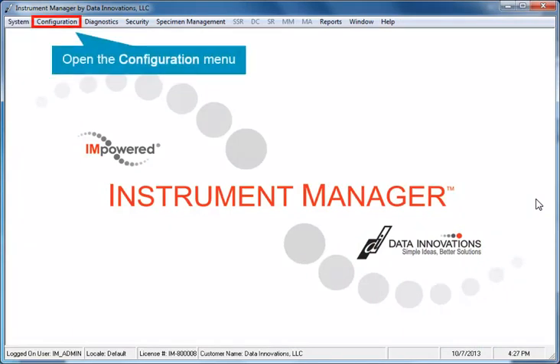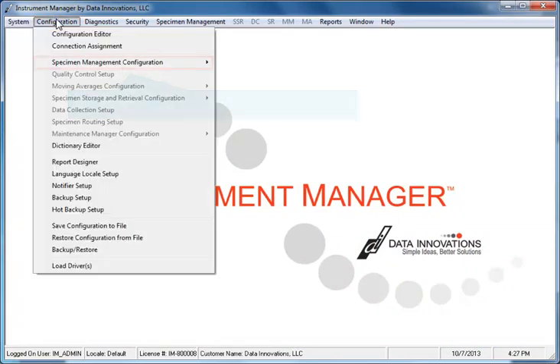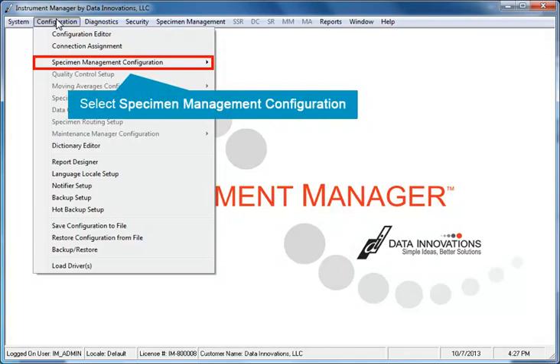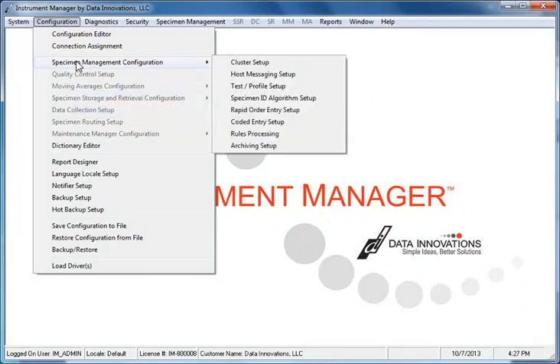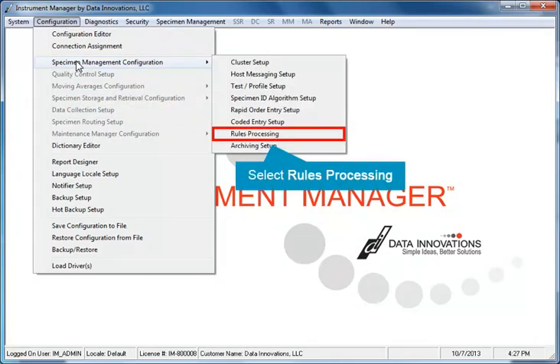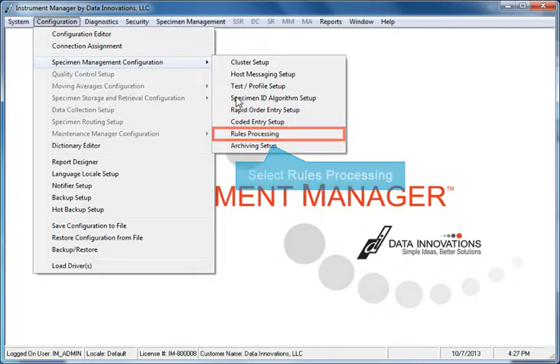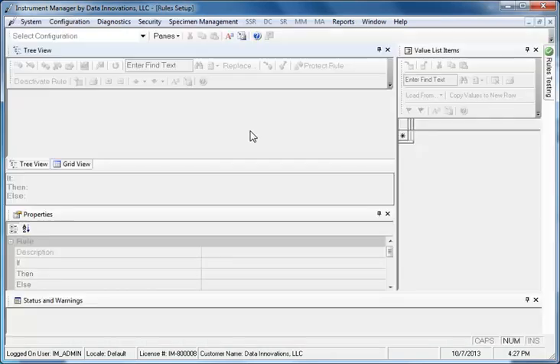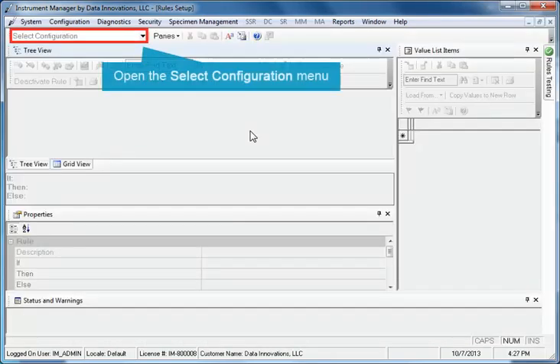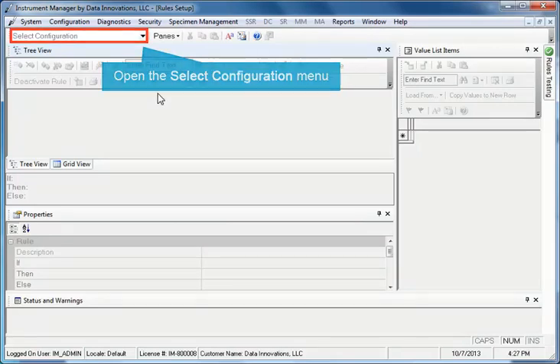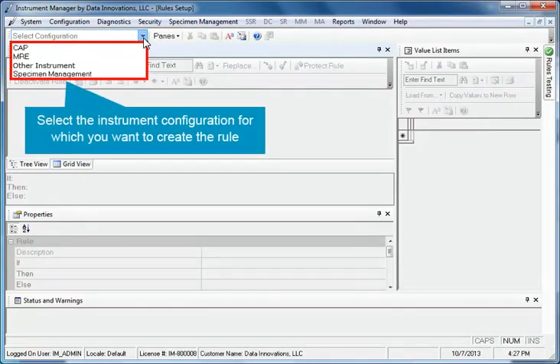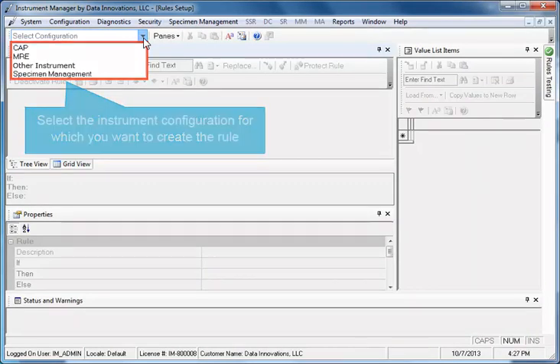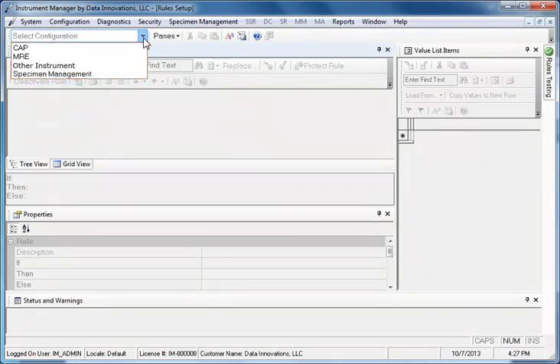To begin, open the Configuration menu. Select Specimen Management Configuration, then select Rules Processing. The Rules Setup screen appears. Open the Select Configuration drop-down menu and select the instrument configuration for which you want to create the rule. In this example, we'll select MRE.